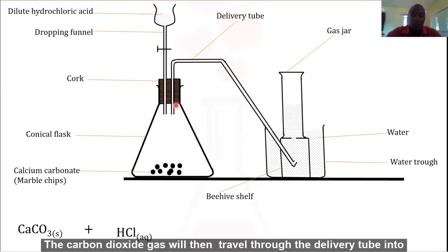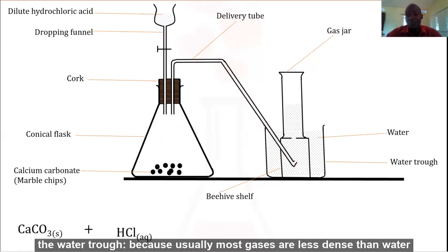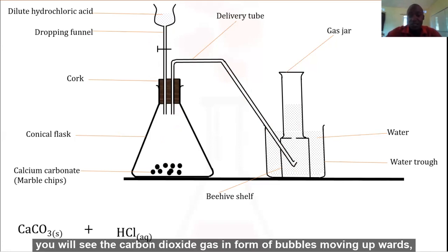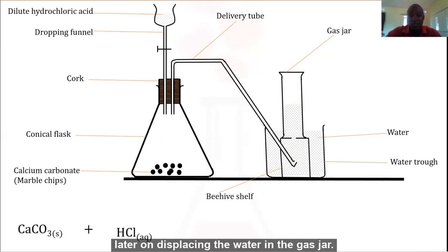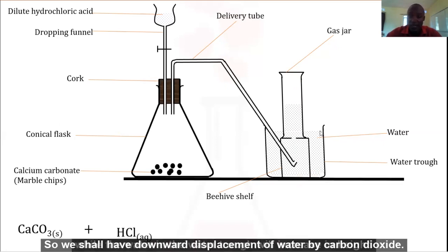The carbon dioxide gas will then travel through the delivery tube into the water trough because usually most gases are less dense than water. You will see the carbon dioxide gas in the form of bubbles moving upwards, later displacing the water in the gas jar. The water in the gas jar will move downwards while the water in the water trough will increase in height. So we shall have downward displacement of water by carbon dioxide.